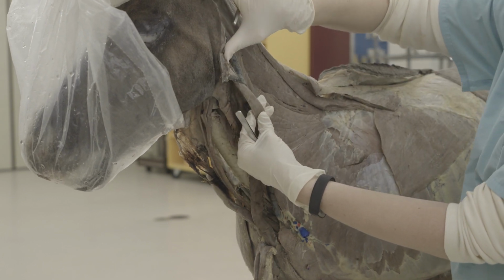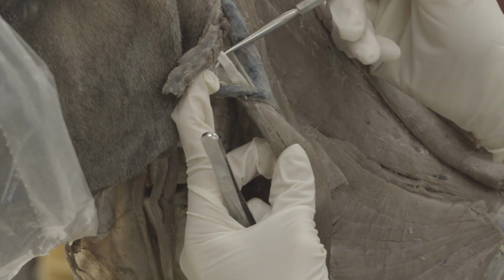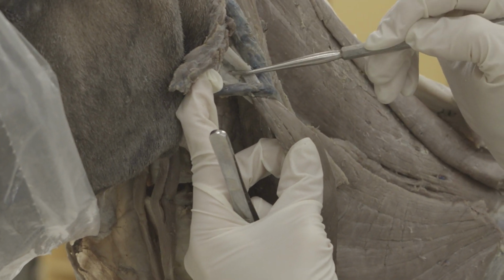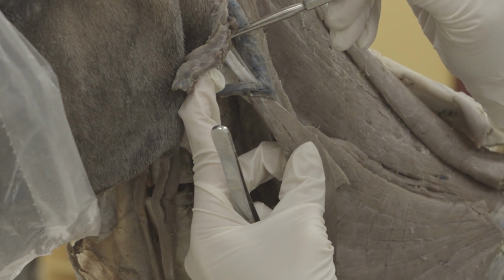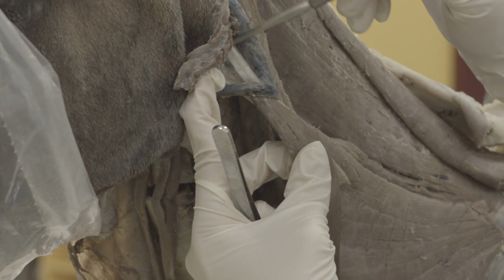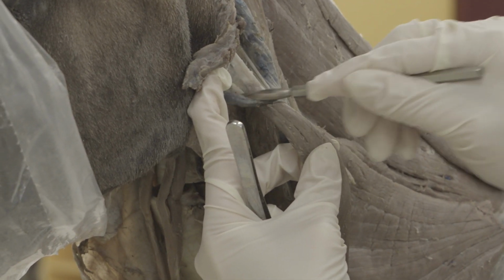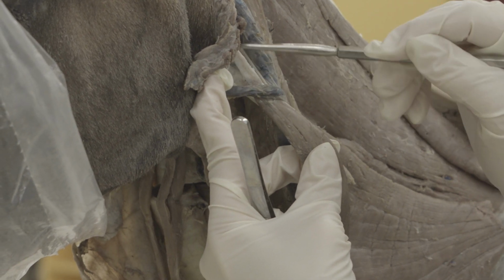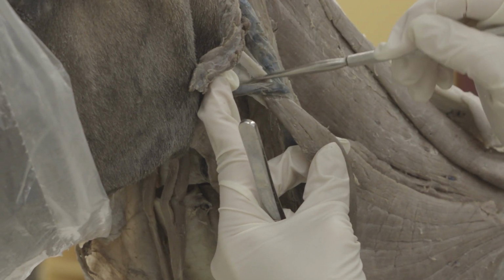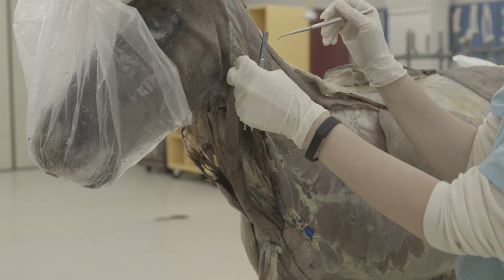And underneath you can see this sternomandibularis muscle has this tendon right here. It's nice and white. This tendon goes up towards the head and forms the dorsal border of what's called Viborg's triangle. So that's a structure that we've talked about, and the dorsal border is this tendon, the ventral border is the linguofacial vein, and the angle of the mandible is the other border there. So that's Viborg's triangle, right in that area where you would drain strangles abscesses. So that's why that's significant.